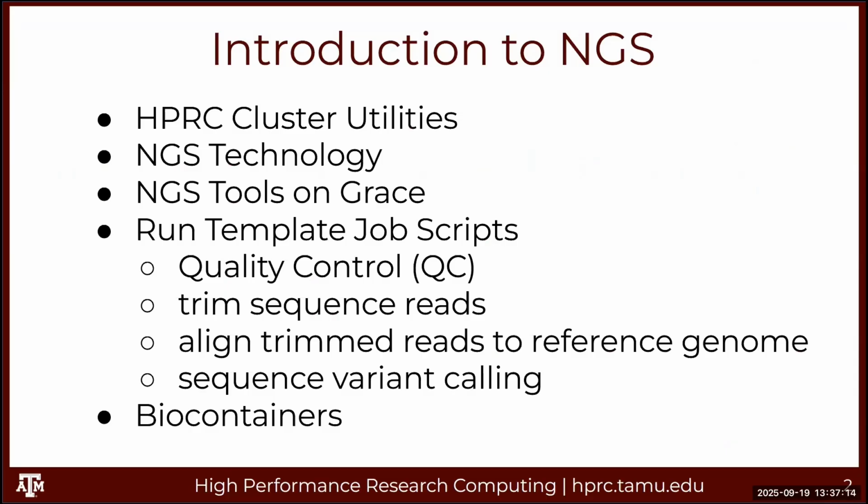And then we have some template job scripts that already have sample input files configured, so you can just run them to see how they work. And you can use them for your own research. All you've got to do is change the input files and maybe add more wall time and more cores, and maybe more options that aren't in the template script, options for the software command.